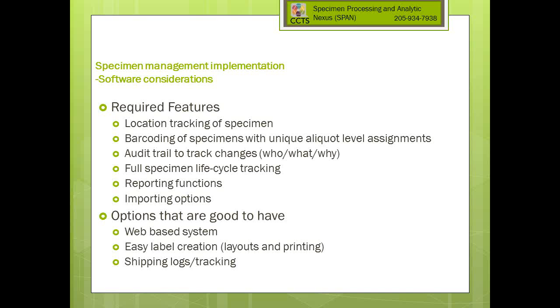So the CCTS, the system we use, is actually part of a clinical trials management system called Encore, which is now on campus. That allows us to know it's collected in a clinical trial or a clinical study at a certain visit. It comes to us, we can track when we got it and how we stored it and where it went. And then if it gets shipped out, we can track when it got shipped, who it got shipped to, and who shipped it.